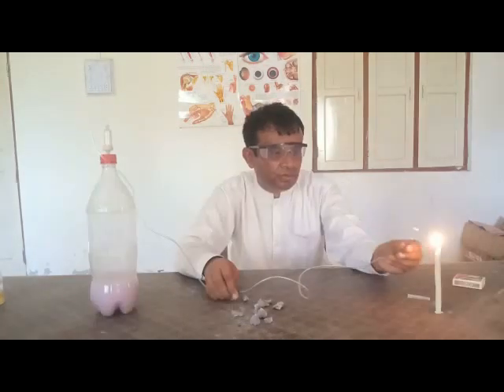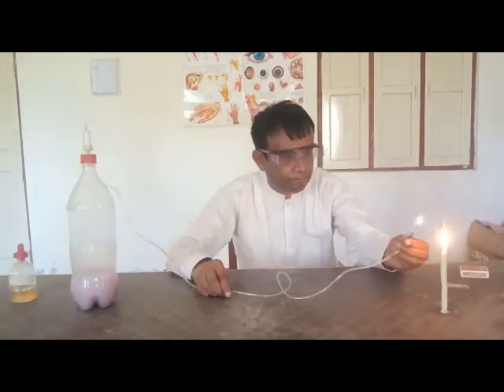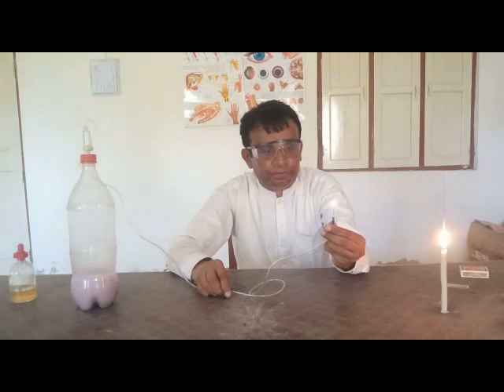So now it catches fire. That's why we say acetylene is a flammable gas. Now look at this.